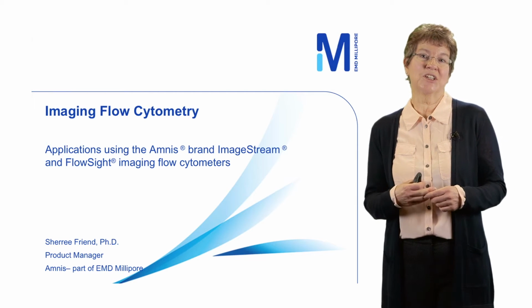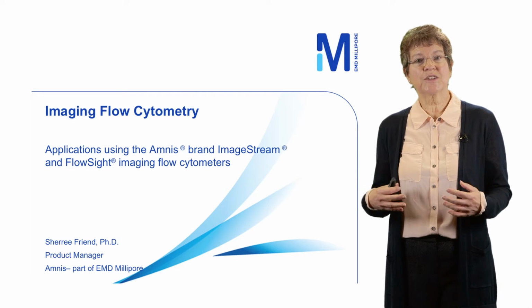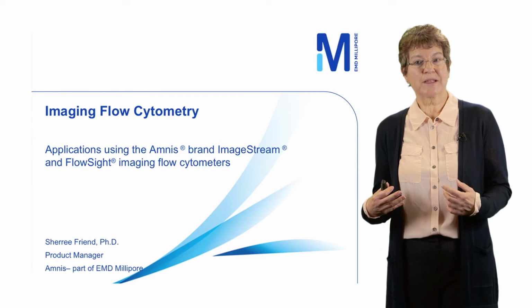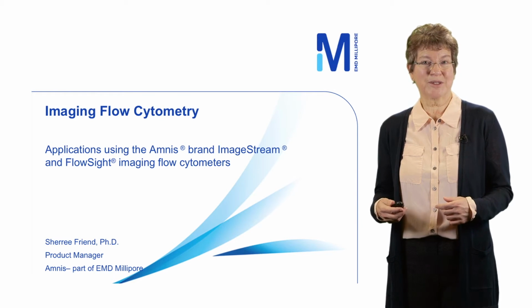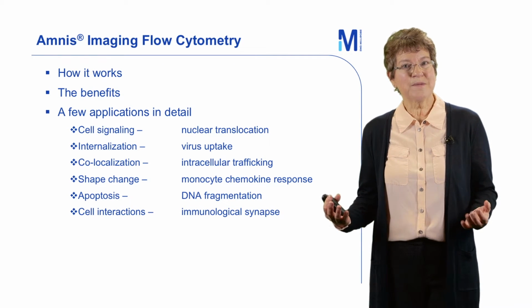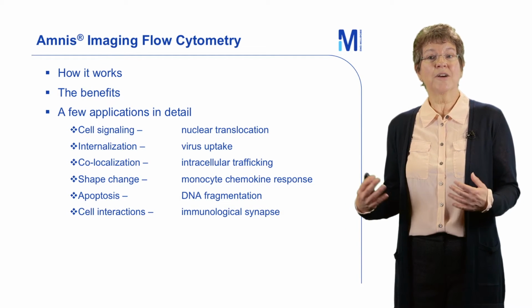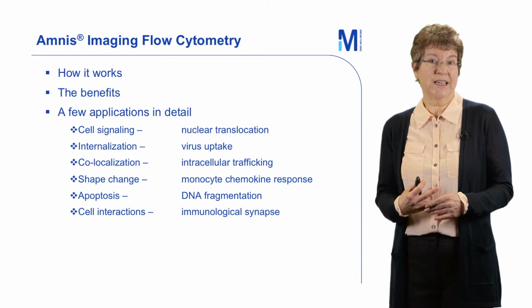And today I'm going to talk to you about imaging flow cytometry, specifically about applications using the Amnis brand ImageStream X and FlowSight imaging flow cytometers. First, I'll tell you about how it works, what the benefits of using the imaging flow cytometers are, and then go through a few applications in detail.